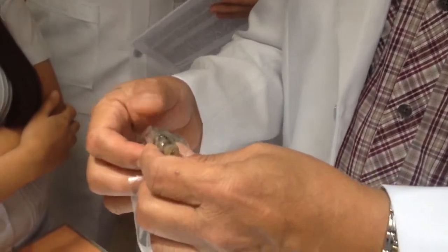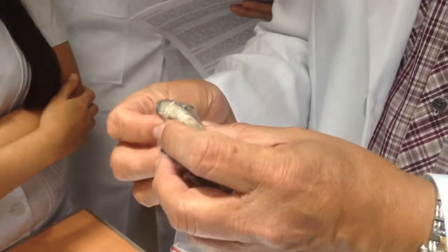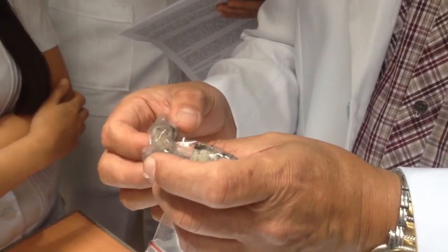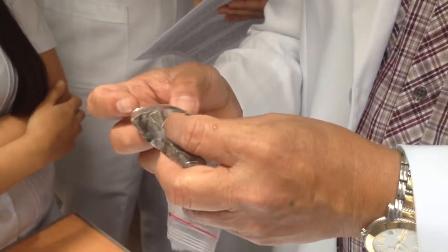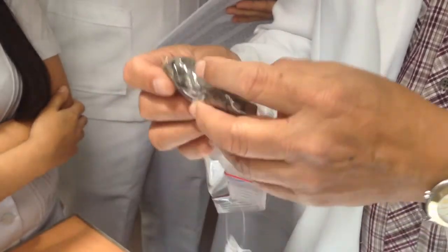So it can involve the hairy portion or the skin. So in this example, the color ranges from gray-white to brown to dark brown or even black. So malignant melanoma is the diagnosis.